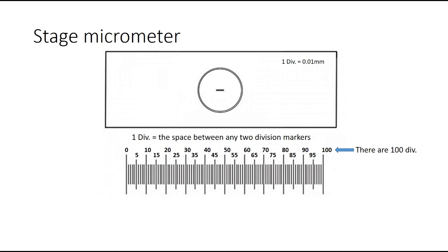This stage micrometer has been calibrated. It states in the upper right-hand corner that one division is equal to 0.01 millimeters in length — that's pretty small. So the space between any two given division markers on this ruler equals 0.01 millimeters. I usually find it easier to convert millimeters into micrometers: 0.01 millimeters is the same as saying one division equals 10 micrometers. Throughout my video I'm going to refer to one division being equal to 10 micrometers in length.